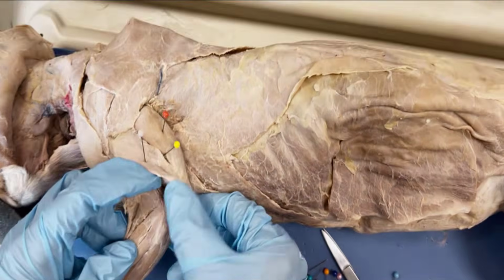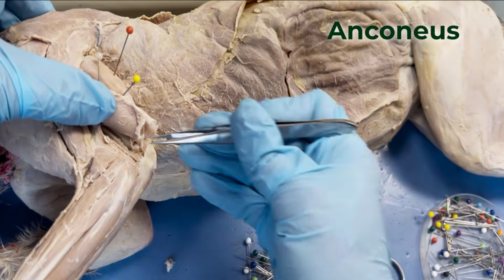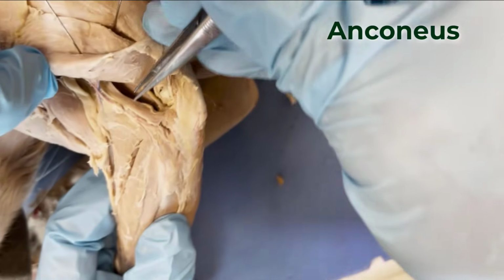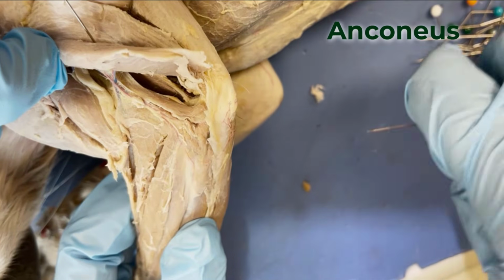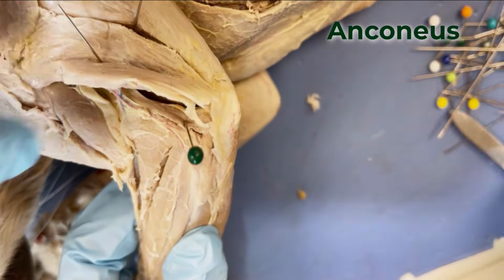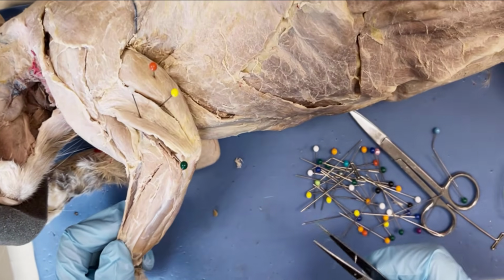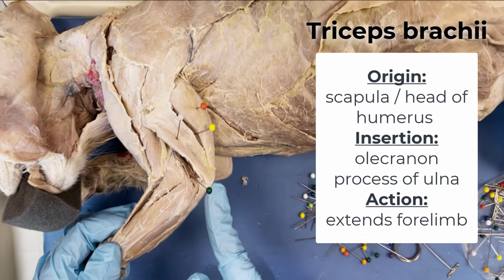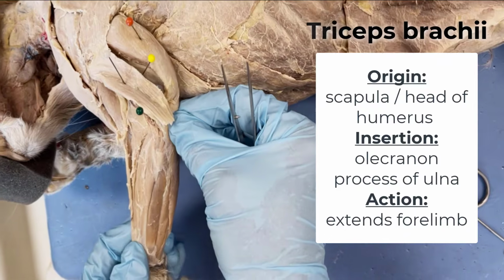Sometimes referred to as the 4th head of the triceps is the Anconeus, which I kind of split there, but there's the Anconeus, sort of wraps around the back of the elbow, right in here. So there's Anconeus. That guy there. Let's see, did we get, yeah, triceps is coming from the scapula back in here and the top of the humerus, and then inserting on the olecranon process right there, so that can pull that straight when it's contracted.